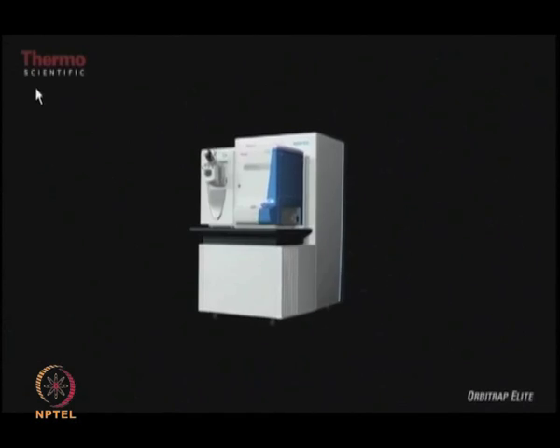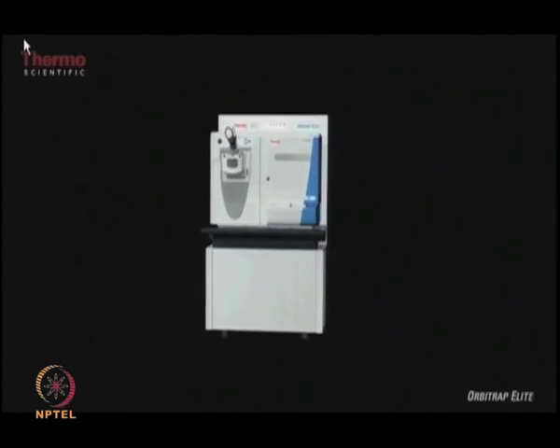I think you mentioned that you want to show some more detail on the path of these motions. Yes, I have a small video which we can also see. Just introducing the newest technology, that is the LTQ Orbitrap Elite. The LTQ Orbitrap Elite is a hybrid system which has two mass spectrometers.